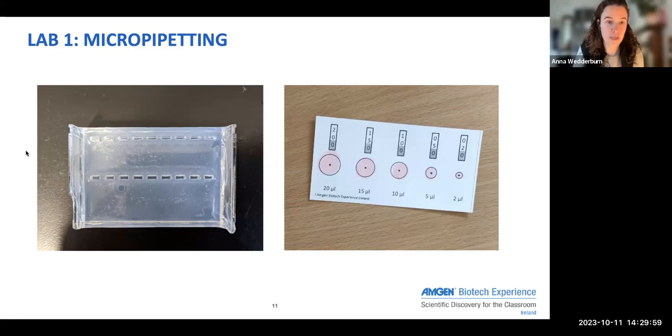The other thing we do in lab 1 is we give you some practice gels. This comes into play in labs 2, 3, and 4, where we'll be doing gel electrophoresis. So in lab 1, we just get them used to the idea of pipetting into an agarose gel, because they're kind of tricky. You can see the wells here, the rectangles. They can be quite tricky to see because everything is invisible. The gel is invisible, the wells are invisible. It's all a bit invisible. So what we get them to do here is just 8 microliters into the practice gel.